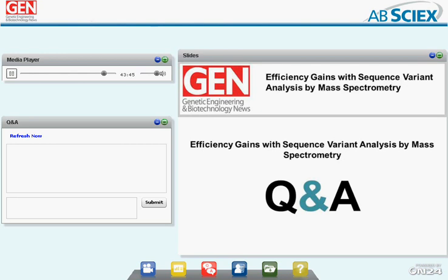Thank you, St. Jason, turning back to you, how long does it take to do these partial de novo searches? Do you do this for all your clones now? We typically take about anywhere from 30 to 90 minutes per database file, and we're now working this into all of our clones that are subjected to peptide mapping.